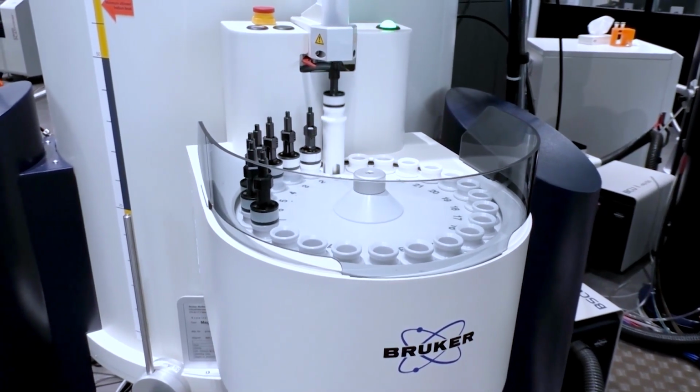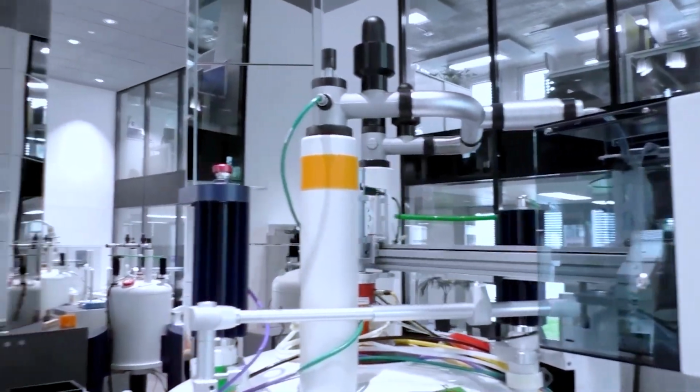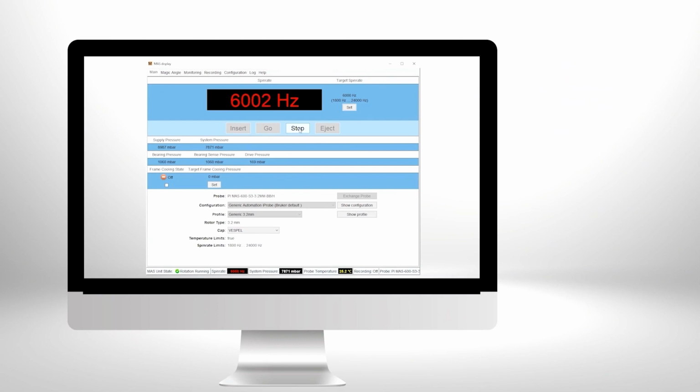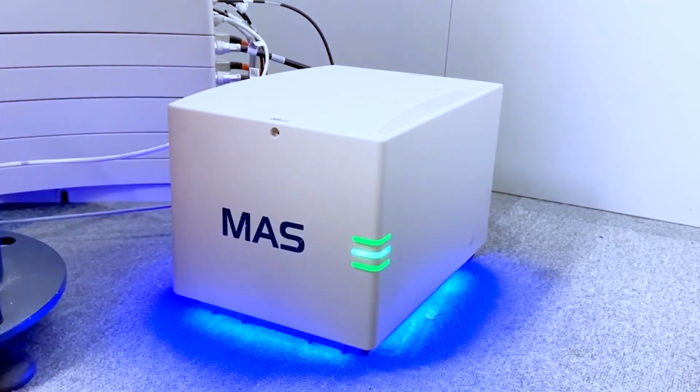Because if we do a solid state NMR experiment with solid state NMR equipment, we still measure the liquid components. So we see both basically. We get the full package. We get the electrolyte signals, we get the solid material signals, and we get the signals of species that are forming in between. And this is, of course, a very, very powerful technique intrinsically.